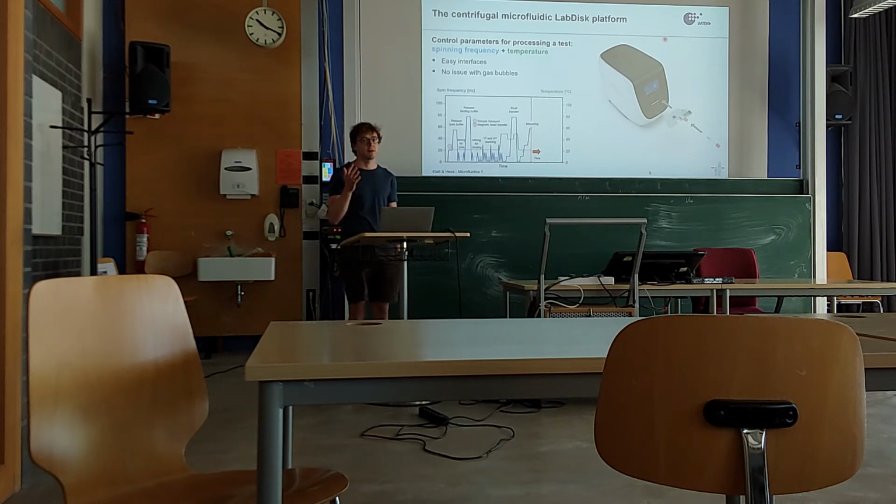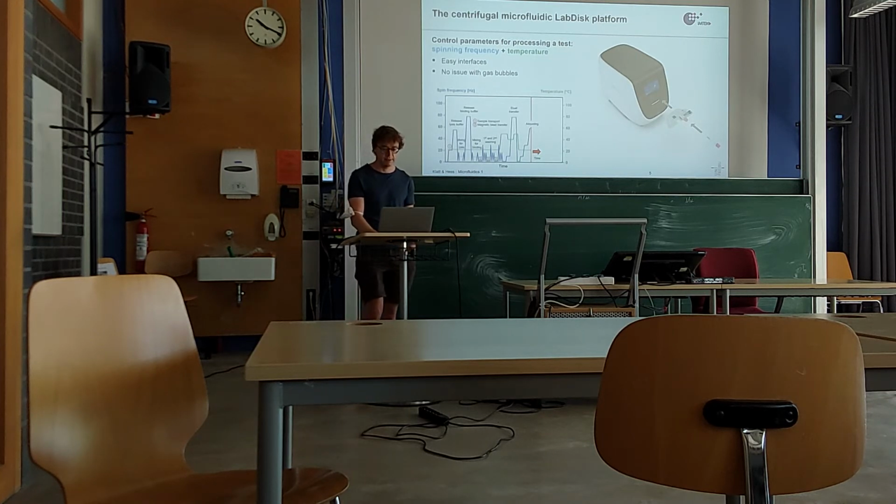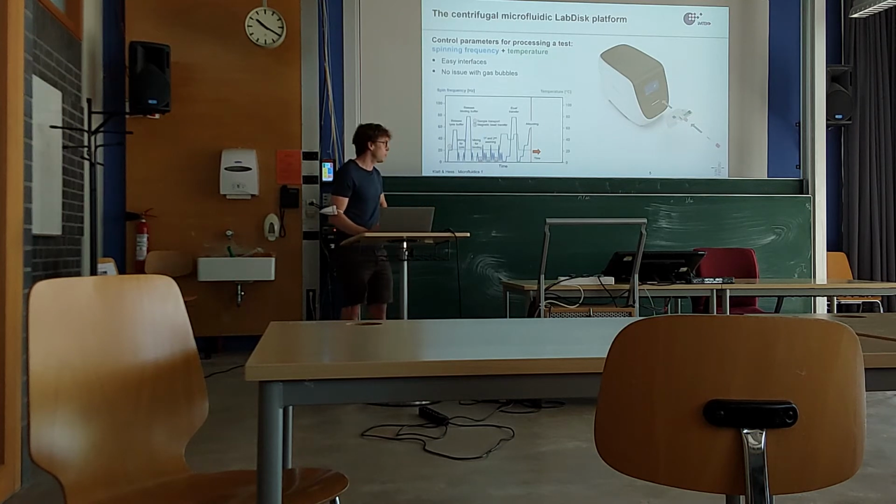Okay, so maybe think of centrifugal microfluidics as a gravity field. Okay, so one of the guys who joined us online says that they are lighter, so they won't migrate as fast. That's almost, that's very close.